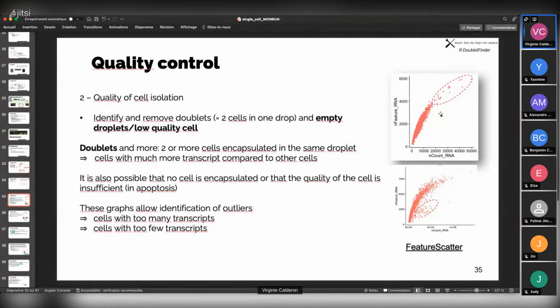So that was the first step, with the summary from Cell Ranger. If you have any issue at this point, maybe you don't have to spend more time if the quality is not enough. If you have just 200 cells and you were expecting 2,000, maybe just don't spend time on bad quality experiments. That's why it's really important to check this HTML report, to be sure that the data works, the work of the bioinformatician.